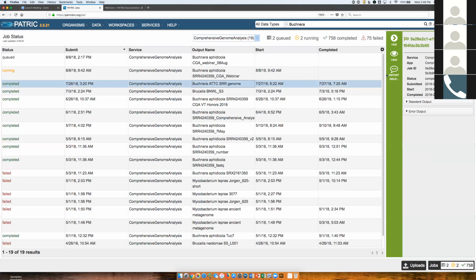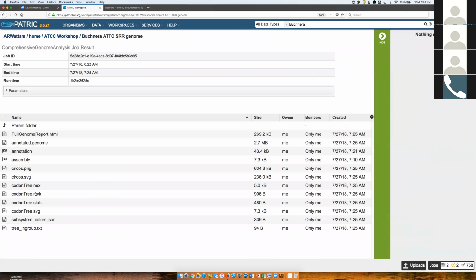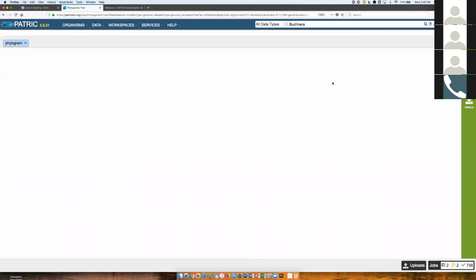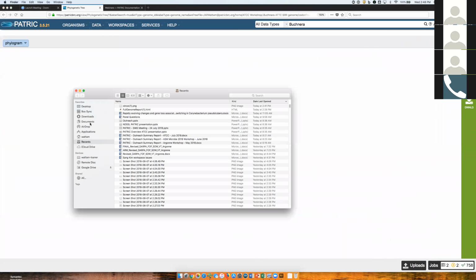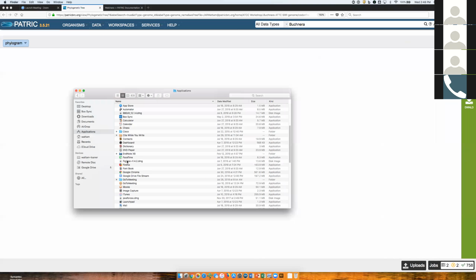And I'll look at this one and I'll view it. I'm just stepping you guys through it again so that you can see it. And the Newick file, and I'm hoping it will view. So it's going to take a while to do it. But while it's doing that, I wanted to show you guys this thing that I really like, applications. And it's Fig Tree. This is the one I use all the time.